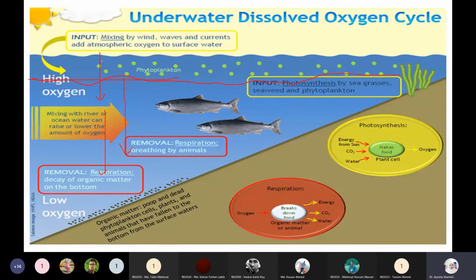However, what we typically give you is a surface water sample, from a pond next to BUET. Our lab attendant takes a bucket, which can be airtight, and they first dip the bucket inside the surface water and rinse the bucket with that water.